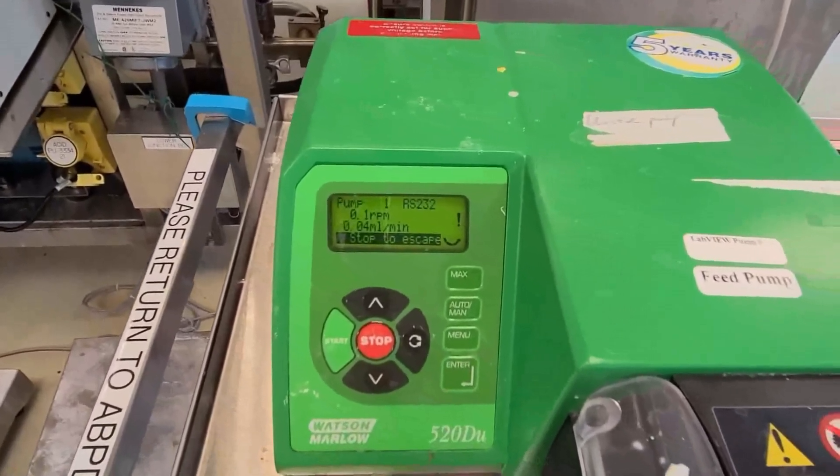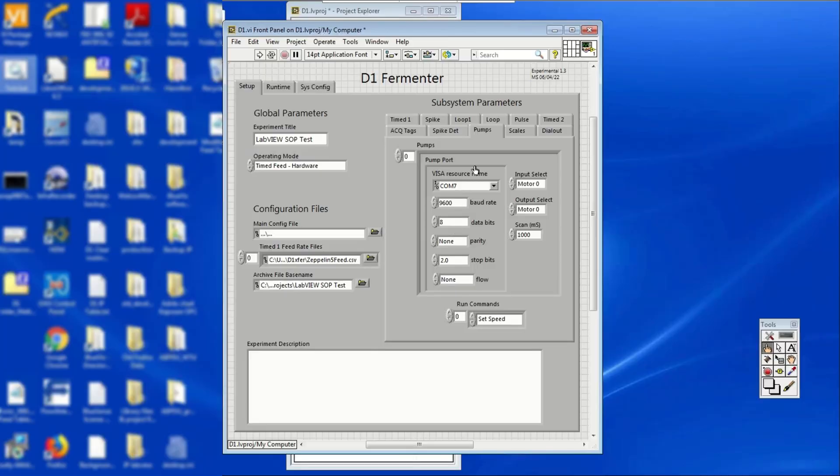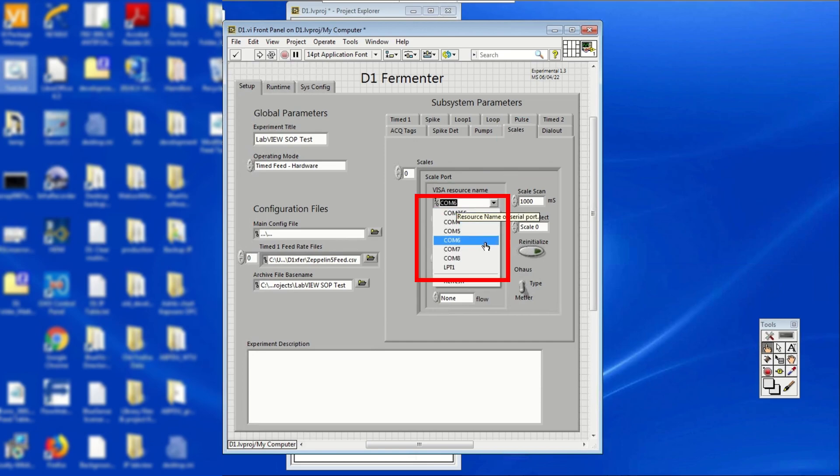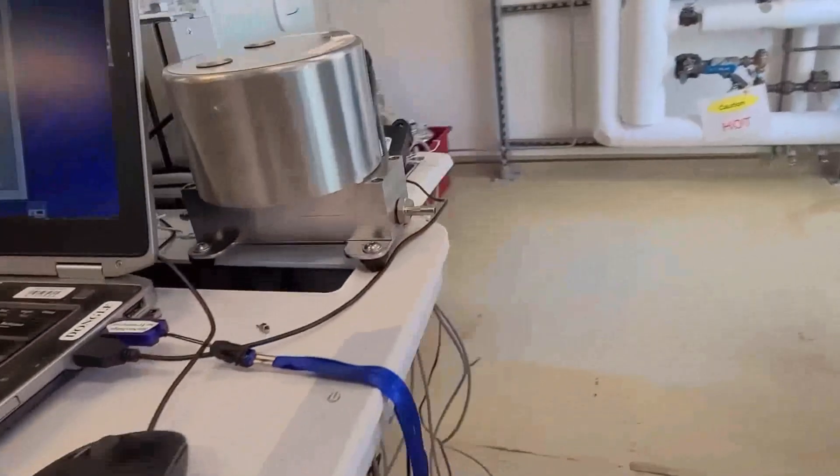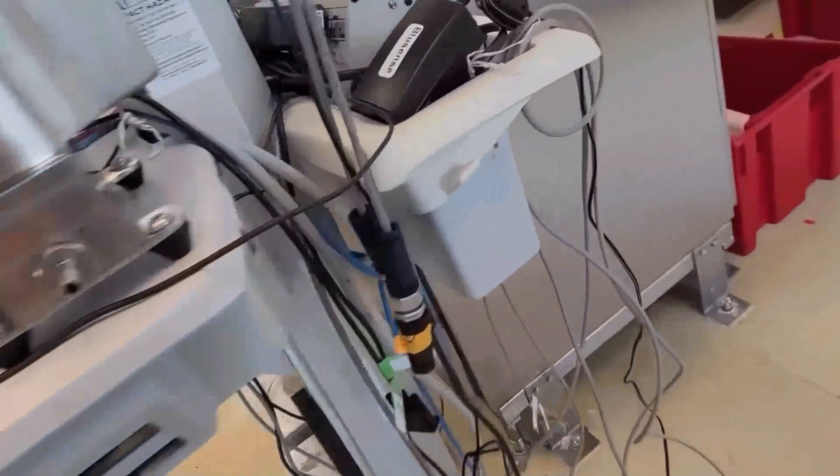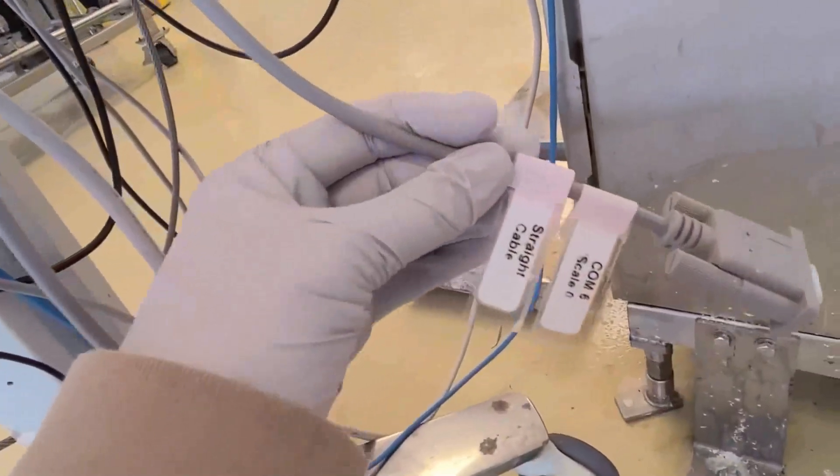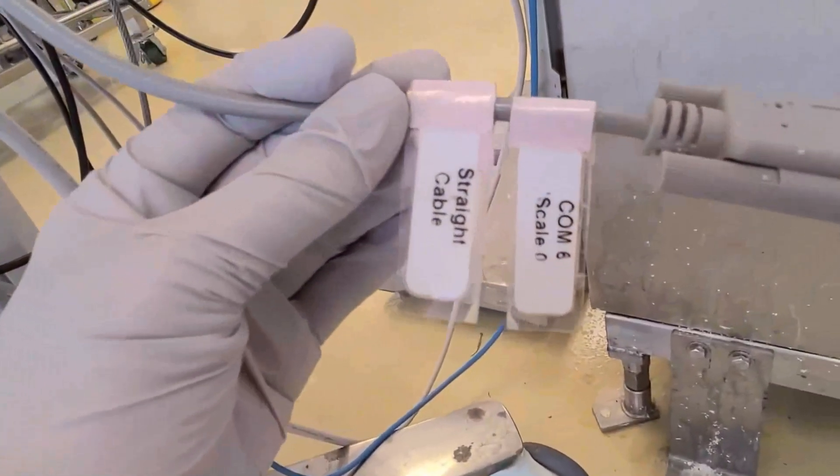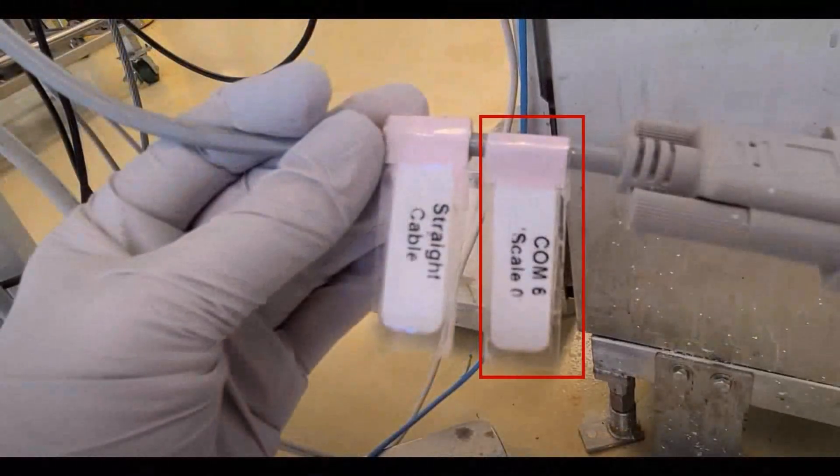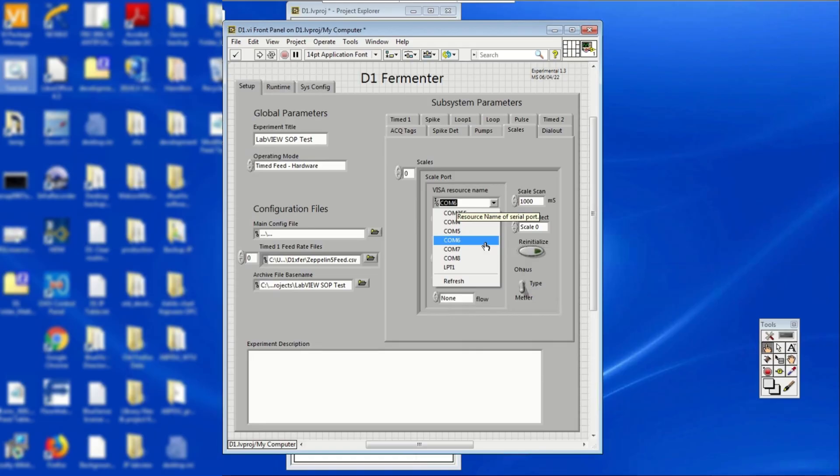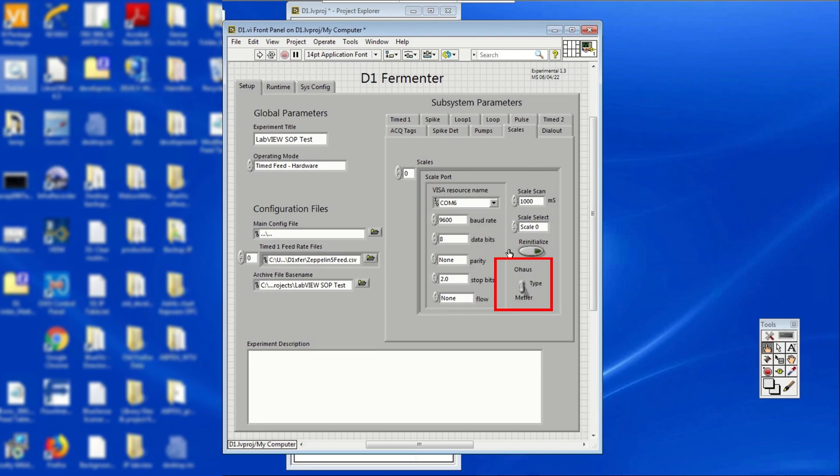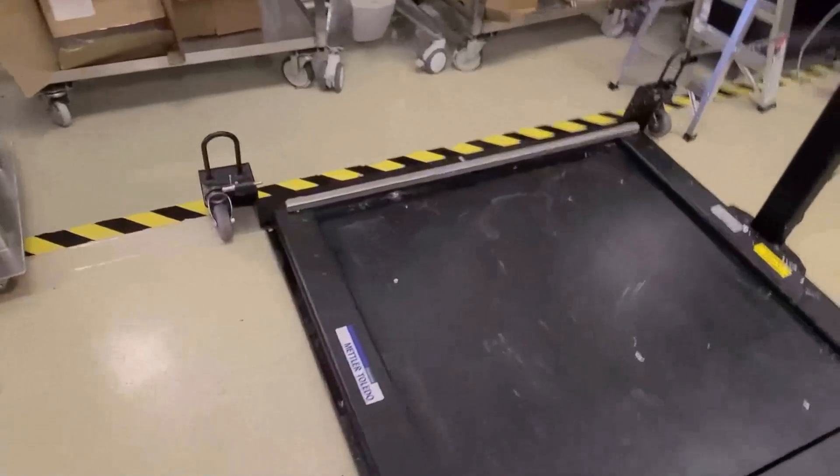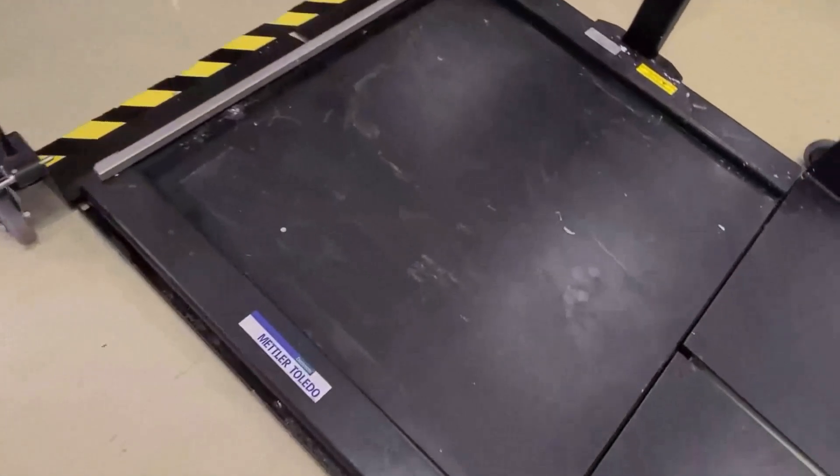Follow the same procedure for scales. On the visa resource name drop down menu, click on the scale name. Additionally, check the specific type of scale being used. Switch to OHAUS or Mettler according to what you are using.